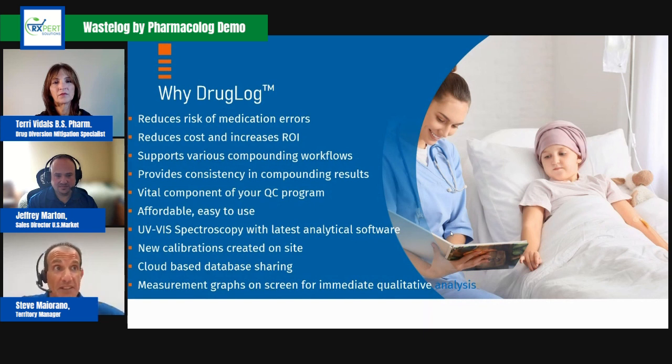Obviously, if we're sending out the right item to the patient, there's no chance of a medication error, which, if there is an adverse reaction, the patient is going to wind up staying in the hospital a lot longer, which obviously is a lot of cost. All the different types of compounding workflows that are out there, it fits into those very, very easily.